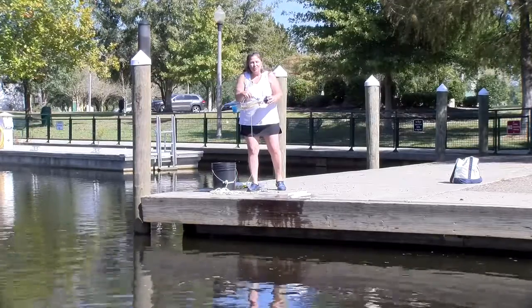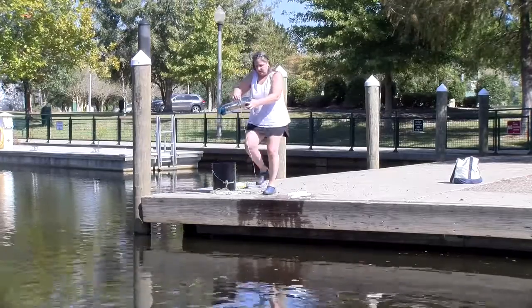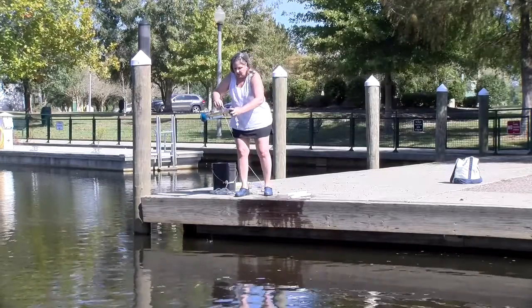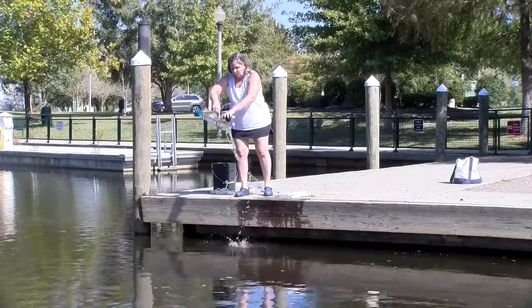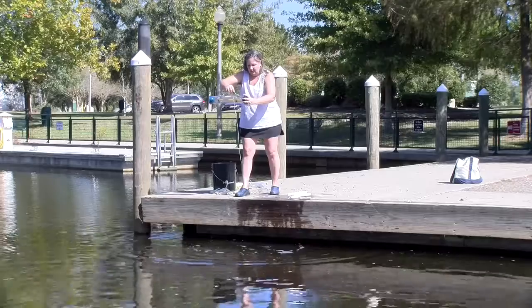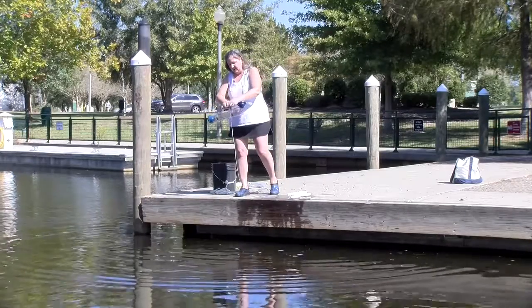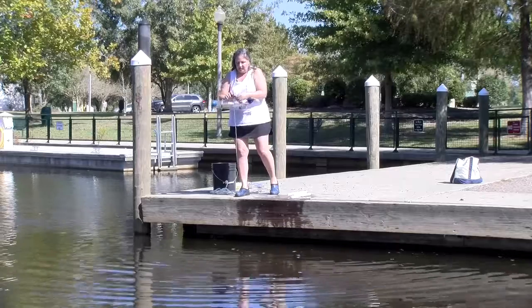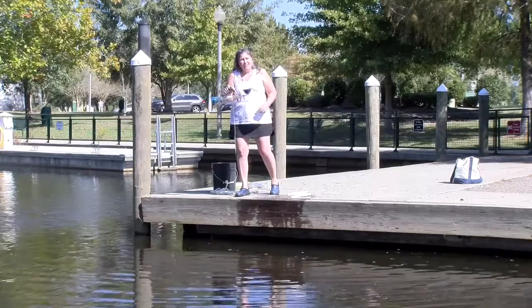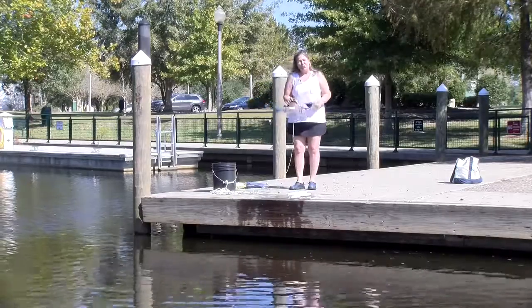Always rinse your Van Dorn out before use and after use so that you don't carry anything from one body of water to another. And always, when you're done sampling, leave it open so that it can dry out. And now you've made your water samples.